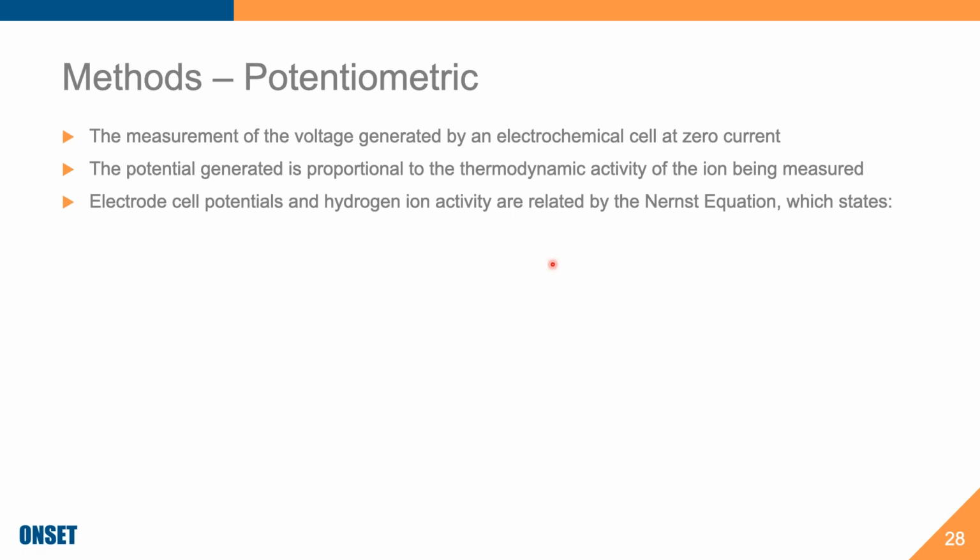Okay, so potentiometric, this is the method that I'm going to cover. It is the most common method out there for scientists and educators, aside from ISFET, and ISFET I'm not going to cover either. That's a technique for monitoring pH as well in a somewhat potentiometric way. It's just a little bit of a different method, has different advantages and so on.